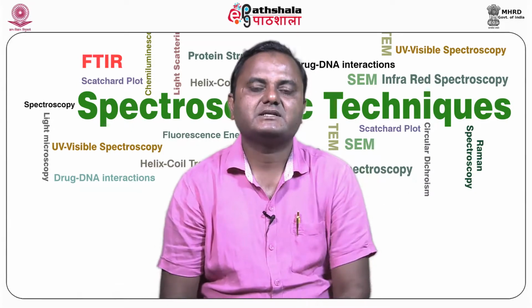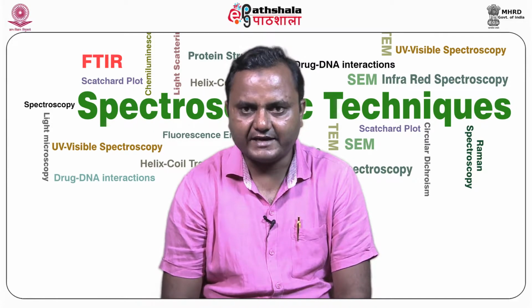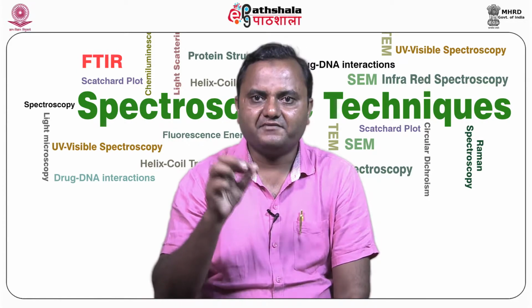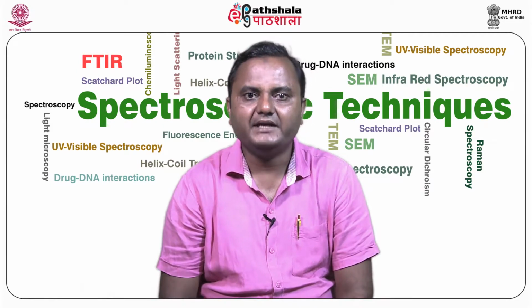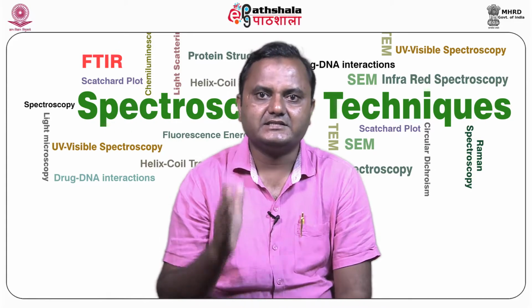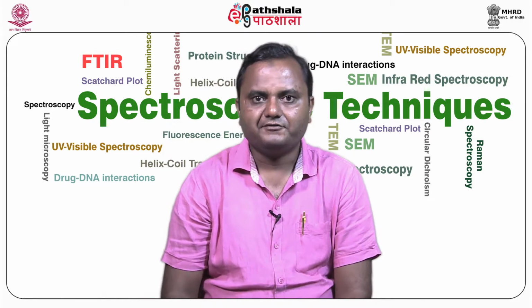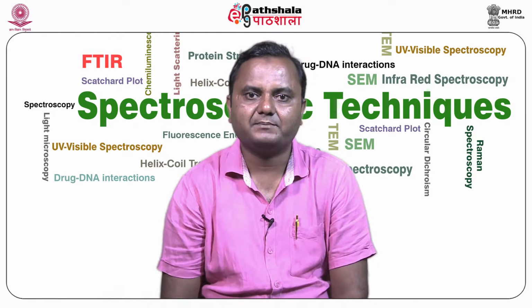Now, we will discuss a simple comparison between static light scattering and dynamic light scattering. SLS measures the intensity that reflects the molecular weight of the particle. It measures at many different angles, typically 10 to 100, and the intensity is averaged over time, that is, 1 second or more. If we talk in terms of fluctuation, it reflects the diffusion coefficient of the particle.